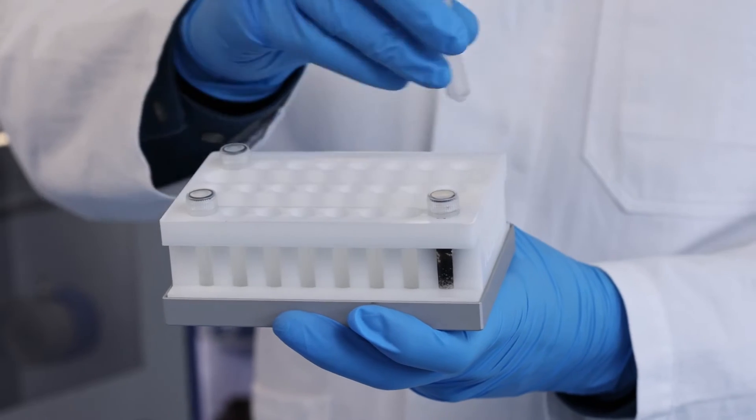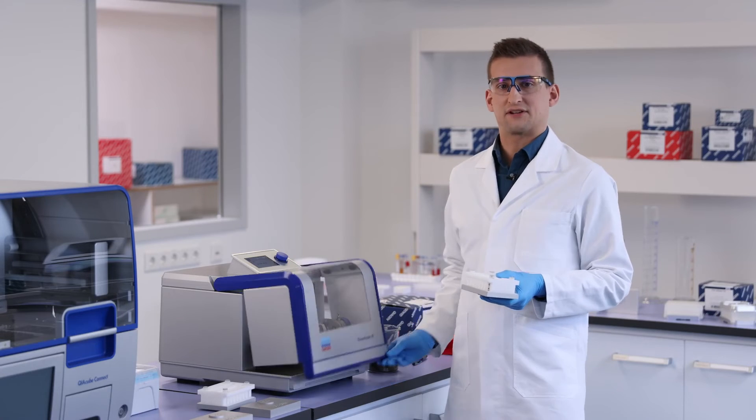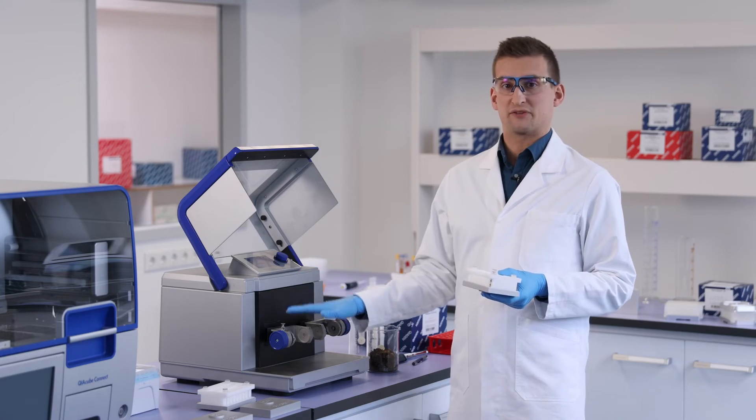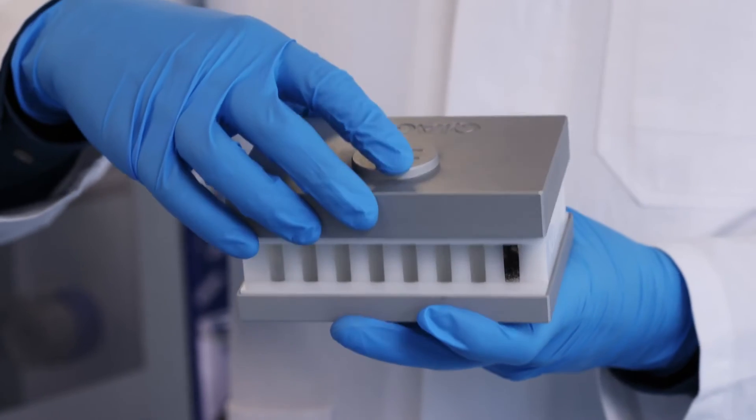Distribute the tubes evenly to ensure safe operation. Never run the Tissalizer 3 with an empty holder, and balance the load between the two adapters. Assemble the adapter. Your sample is now ready for the Tissalizer 3.